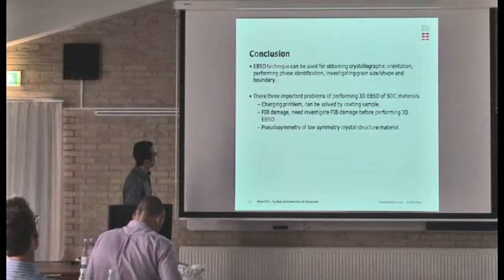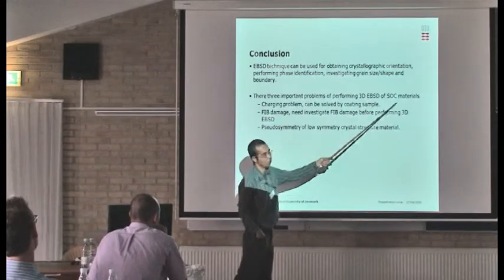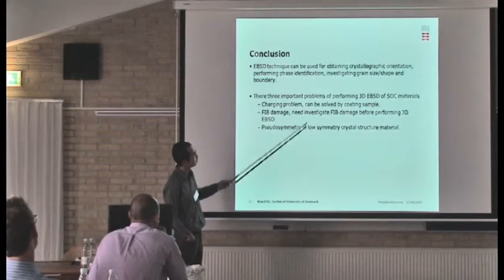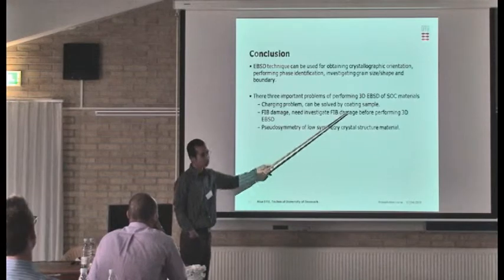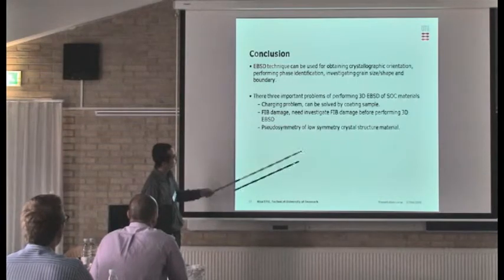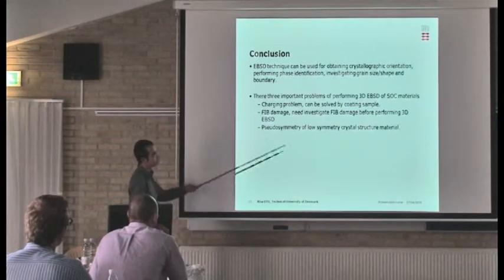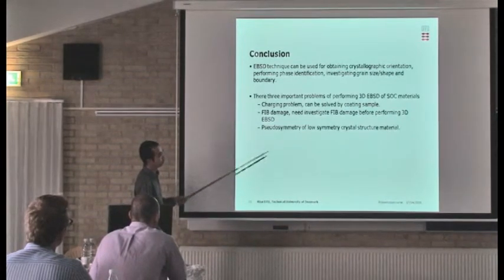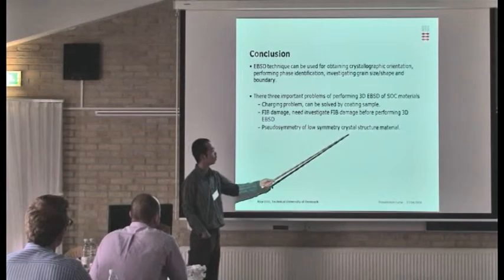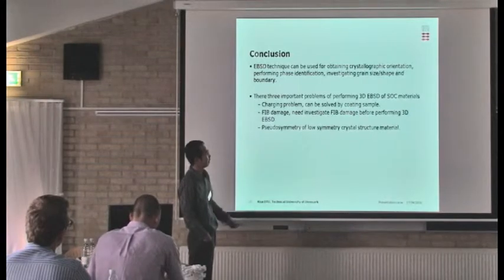And for my study, I found these three important problems of doing EBSD of SOEC: the charging problem, that for some material we can solve by coating; FIB damage, we may need to investigate FIB damage before EBSD if the pattern is not good; and the low symmetry problem for low symmetric crystal structure such as tetragonal.